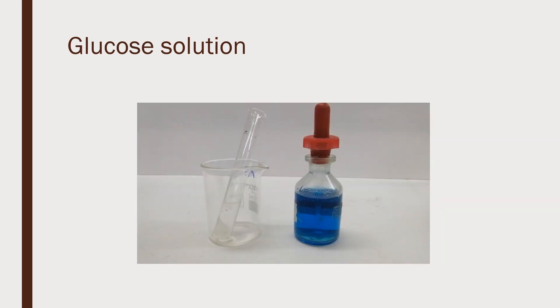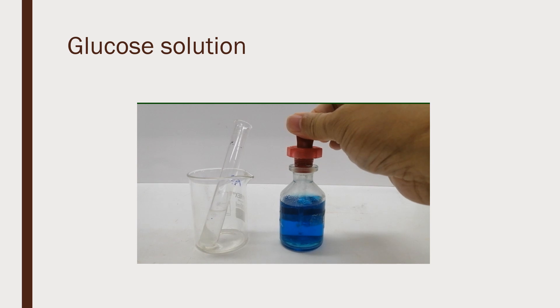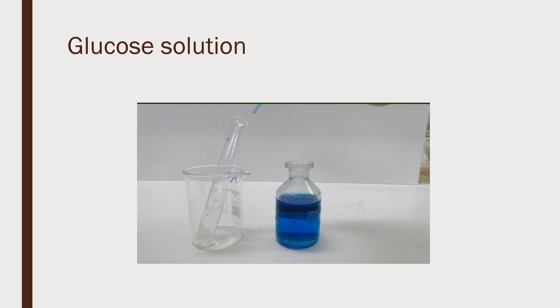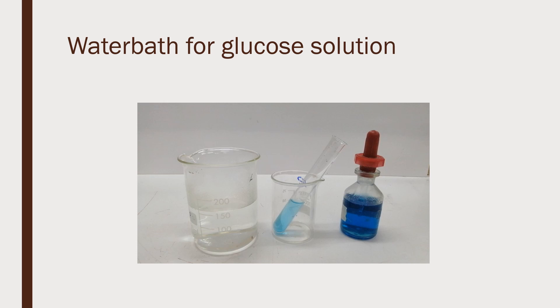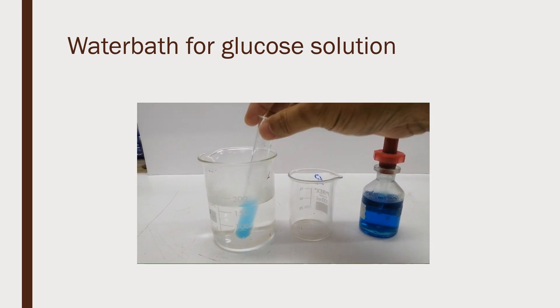For glucose solution as our test sample, we add the same volume of Benedict's solution to the glucose. The glucose solution also turns blue. The next step is to place the glucose solution with Benedict's solution into a water bath for 2-3 minutes.